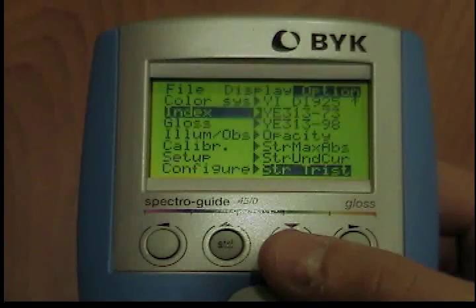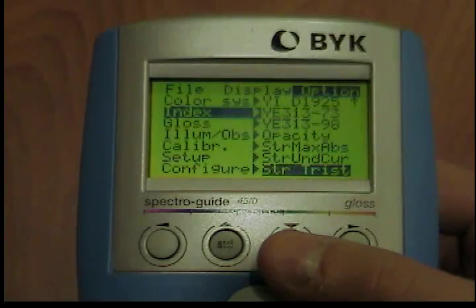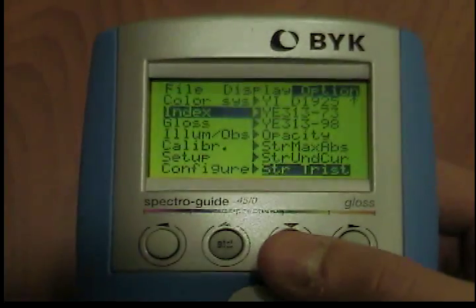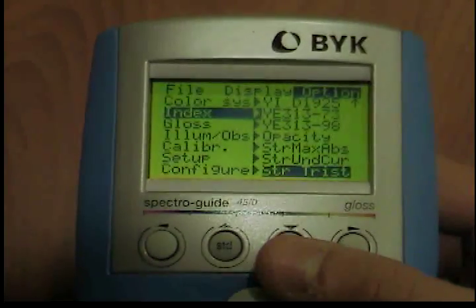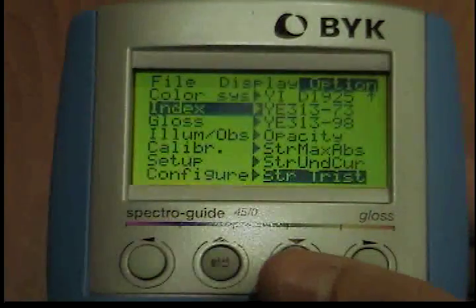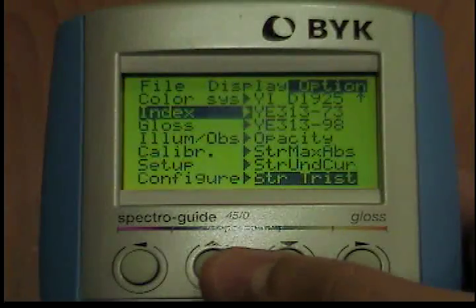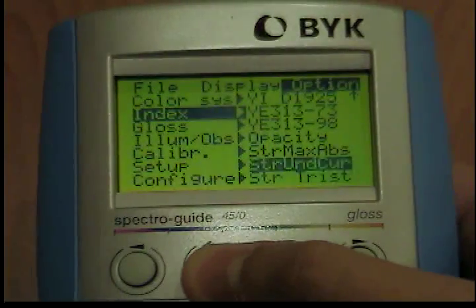The instrument will return to the previous measuring mode and the selected index will appear in the display. Use the left and right buttons to exit the submenu without changing the index.